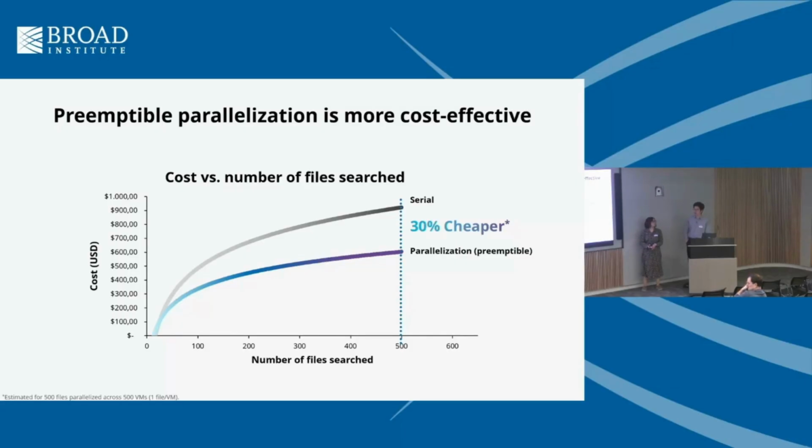But if you're running the parallelized workflow on only 10 files, the overhead will kind of cancel the benefits of the parallelization. So you won't get a very obvious improvement in runtime and cost. So yeah, great question.